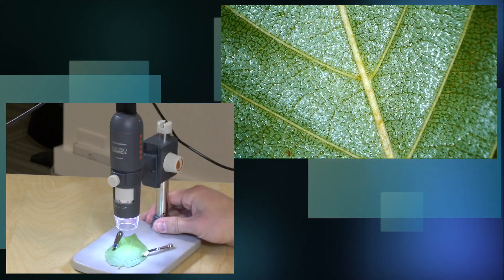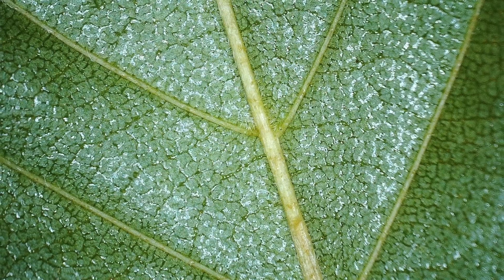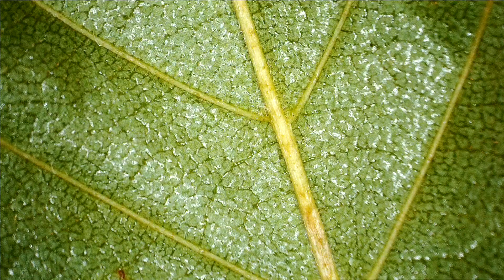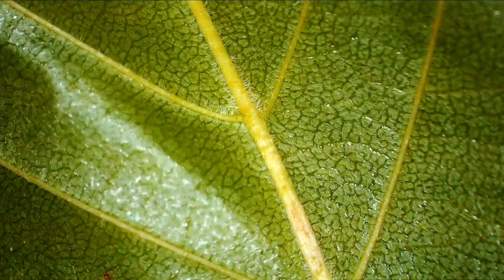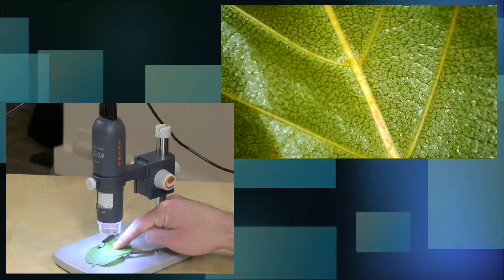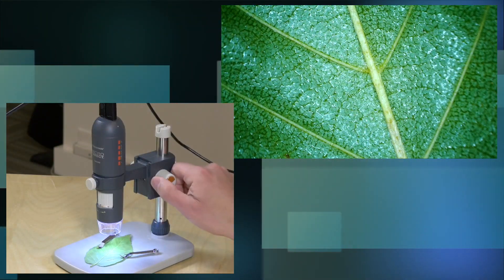Now it has a 3.5 megapixel sensor. It will through interpolation give you larger images, but you really won't get any more detail beyond the native 3.5 megapixels. I'll show you some pictures overlaid here so you can see what the still images look like out of it. But the video quality is exactly what you are seeing right here — I'm moving this leaf and you can see it interacting at 30 frames per second at 1080p, which I think is awesome especially for a classroom environment.